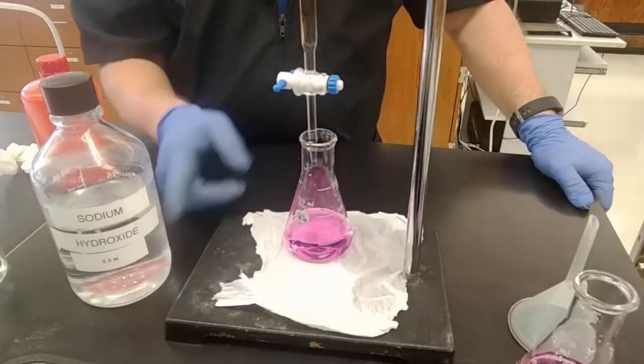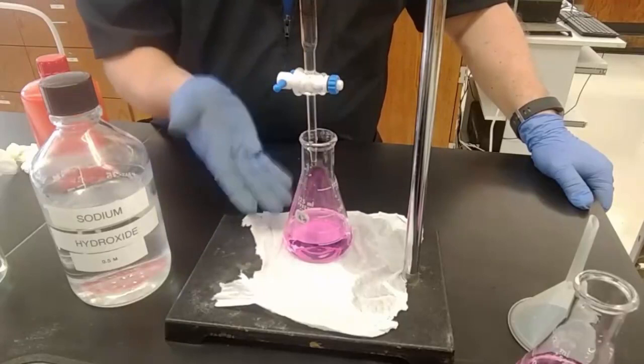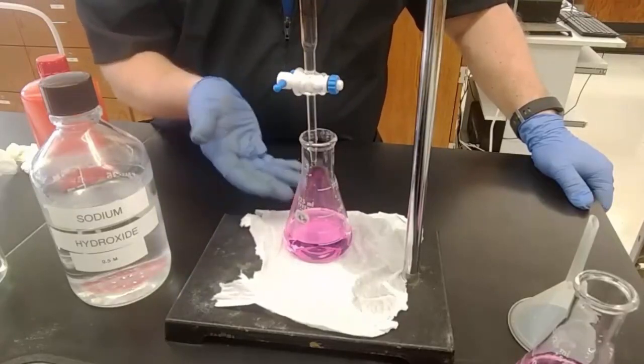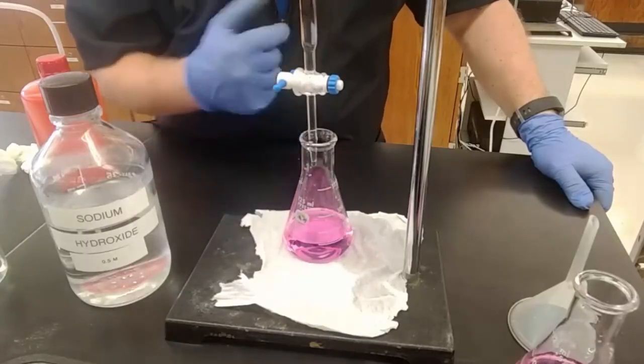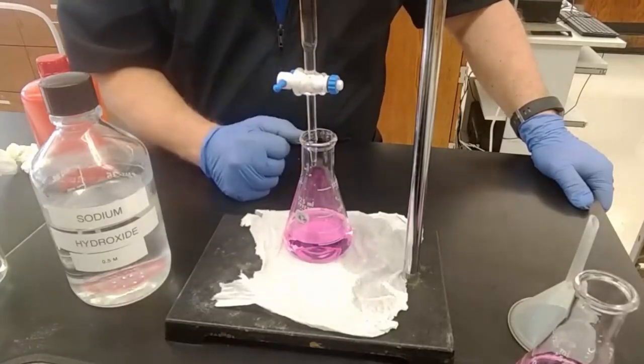And since the number of moles of base is exactly the same as the number of moles of acid, we're assuming, when it's all finished reacting, if I add too much base, it's as if I had more acid to start with. And that's going to give me a higher percentage of acid in the vinegar. So again, ways of explaining any error.